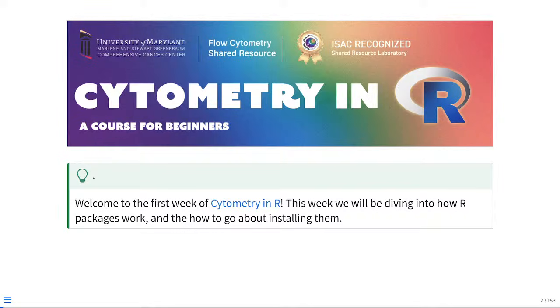So, some of you may be wondering why we put effort into even learning how to do cytometry in R. And there's a couple reasons for this. First, if you think about what's been happening with our field in the last few years, spectral is rapidly growing in terms of the total number of fluorophores we're able to handle on a day-to-day basis. So we're past the 50 barrier, we're heading on 60, 70 markers that we can have within a spectral flow cytometry panel. And this is kind of similar to the situation we already have with mass cytometry panels.